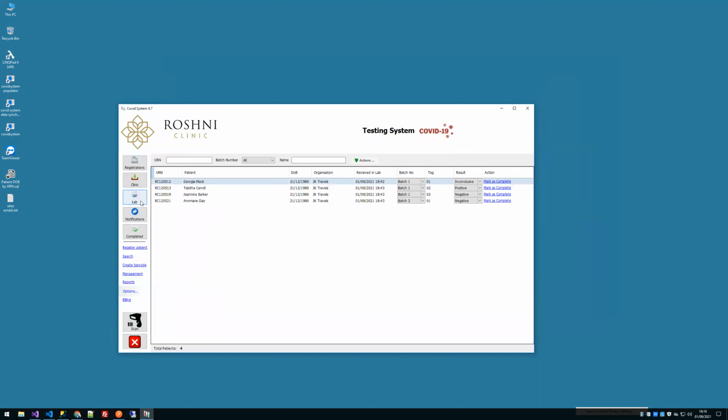Another question. Does your system recognize the status of a country? Like, if someone enters Afghanistan, would your system know if it's red, amber, or green? I see what you mean. No, not at the moment. It's not been a priority for any of my current customers. They know they're not getting any customers from that region, so they've not really requested it. They said, okay, maybe for stats or whatever, but my system doesn't do anything like that. There's no way to pull that information out at the moment, I don't think.